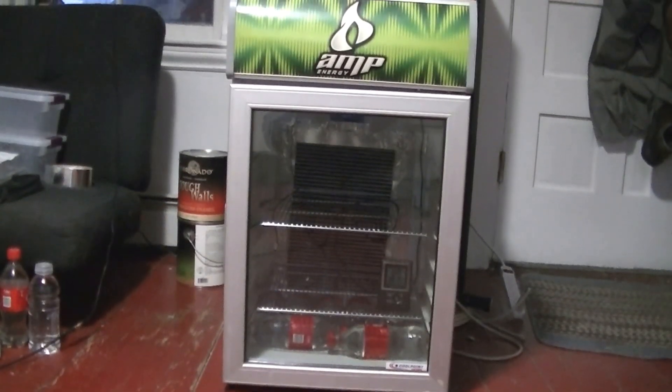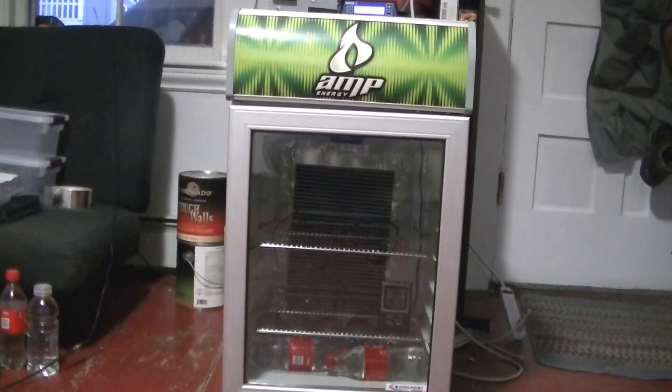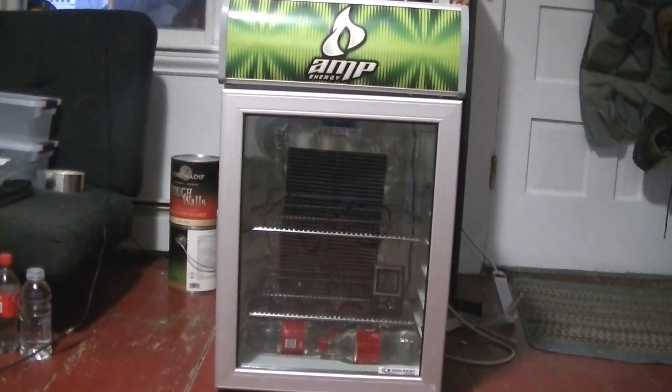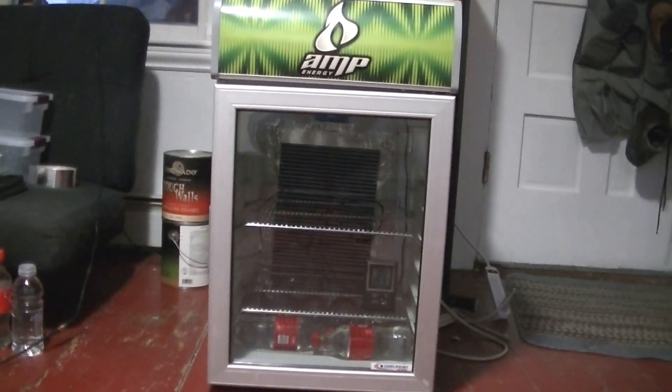Hi guys, so a few days ago I picked up a mini fridge and I wanted to convert it into an incubator, and this is the final result of everything.